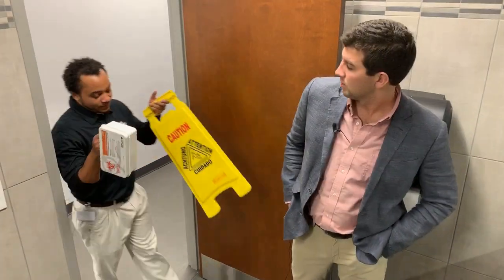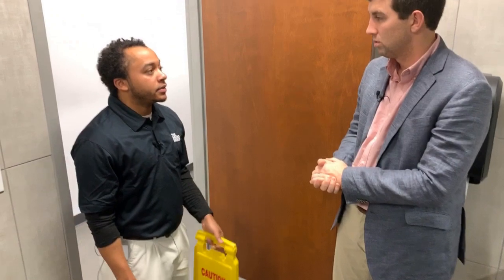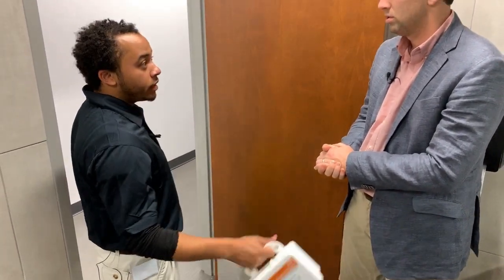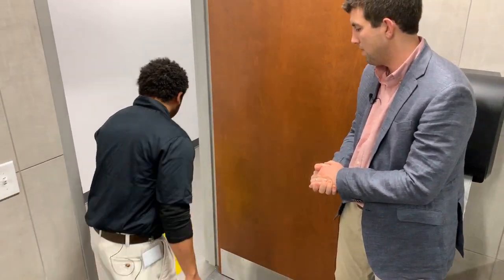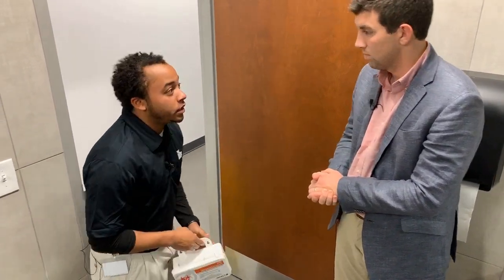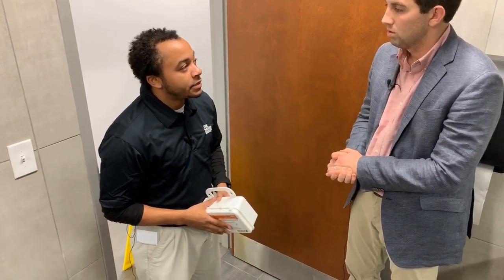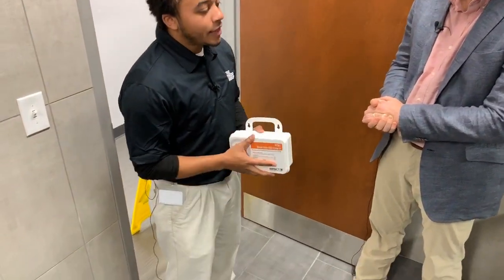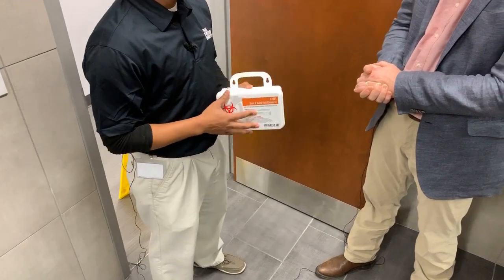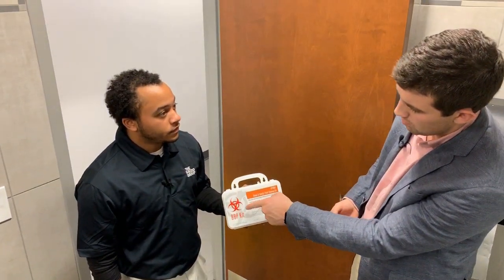Man, I got everything. All right, what do we need to do to get this cleaned up? Well, the first thing we do is quarantine this area to block anybody from coming into the contaminated area. All right. The second thing we need to do is contact our manager and let them know that we encountered a blood spill. Gotcha. And then the last thing we do is clean this up with this bloodborne pathogen kit.